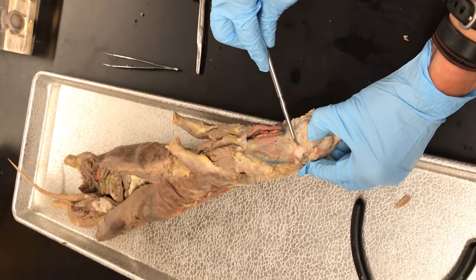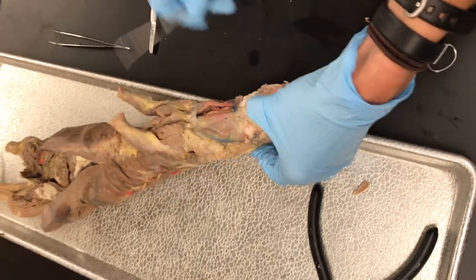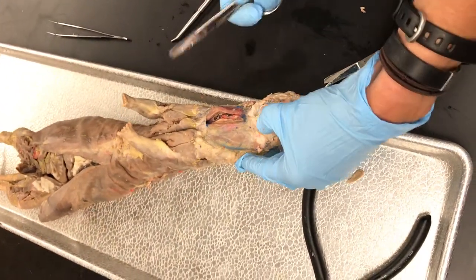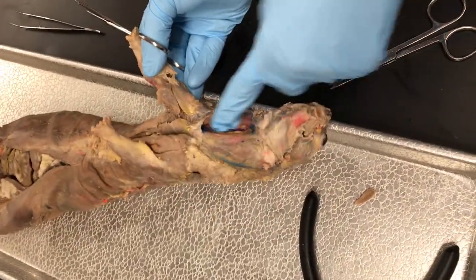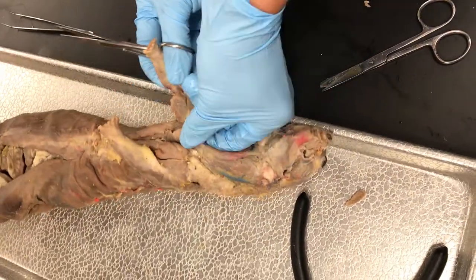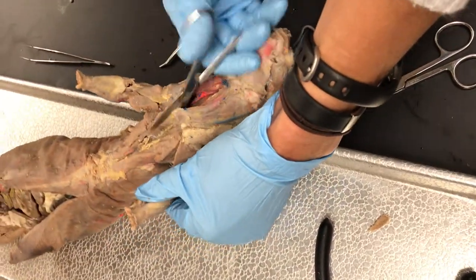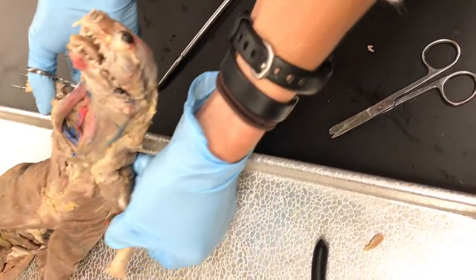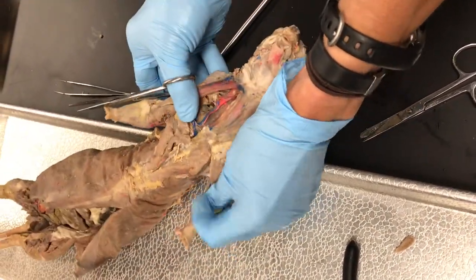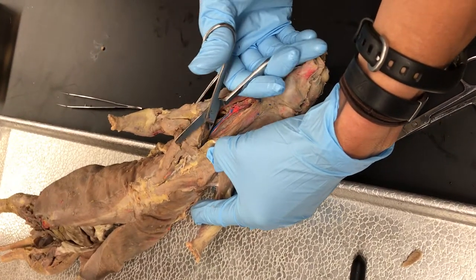Sometimes those mandibular salivary glands will get moved and repositioned when they pull the skin off, so yours might not look exactly like this. To do the thoracic cavity, this one has a hole already there, so I usually just use that as a starting point. Then take your scissors and cut down the middle, and when you do that you can see the blue veins in there.